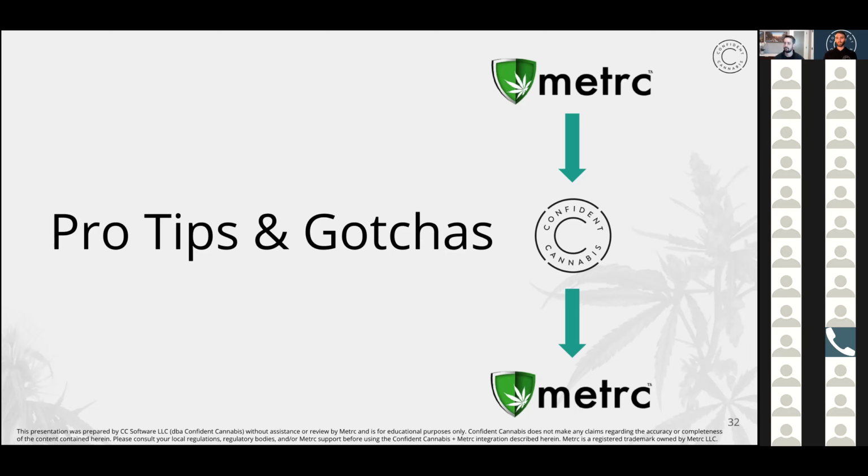Another question is, do we need a Metrc tag as the testing laboratory, for example, for storing retention samples? Or can we use our own tags, the 16-digit Metrc batch on them?